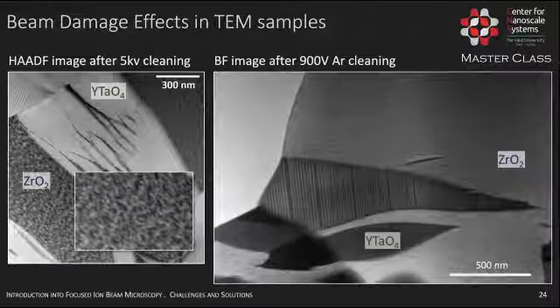Imaging techniques always have the problem that you're band limited. So there is a lower limit, a spatial resolution, and there's an upper limit, how large an object you can analyze. So as in all other cases, you need to get a sense of which frame you fit in, and then use the corresponding information.